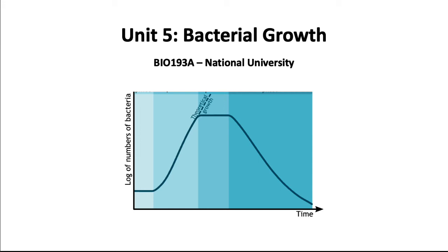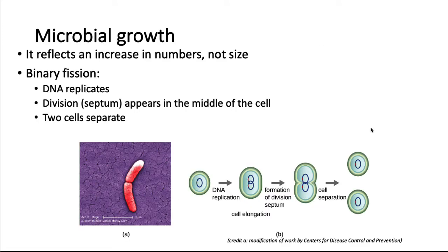Hi class, welcome to Unit 5, Bacterial Growth. In this unit, we are going to revisit some of the concepts from lecture regarding microbial growth, and then we are going to focus on the measurement of bacterial growth as done by spectrophotometry.